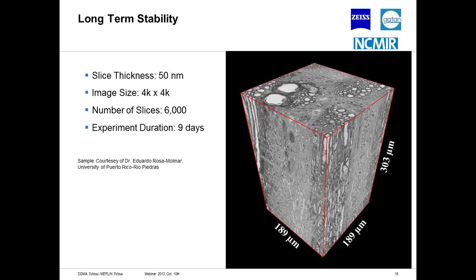If some poor graduate student was working on their PhD and they were able to do this, it would take many, many years. This data set took 9 days to collect, and the system is robust enough and stable enough to be continually collecting images for weeks on end. Winfried Denk, who's the inventor of this imaging modality, has had data sets run up to 3 weeks. So it's very, very stable. It's a beautiful advantage of this technique.